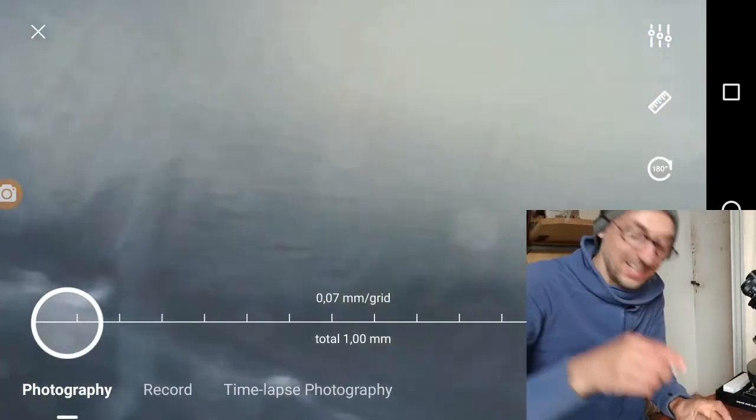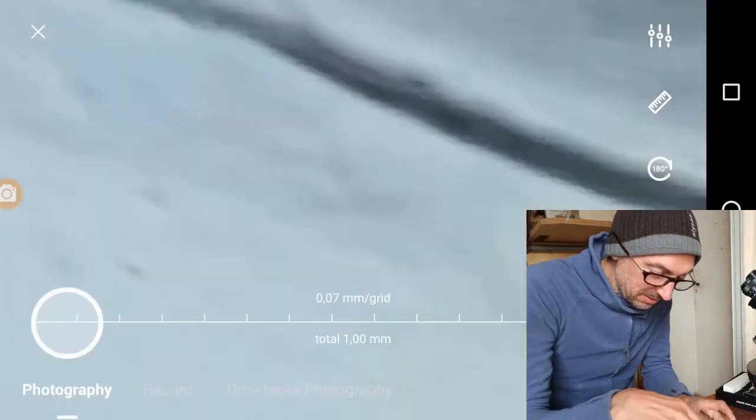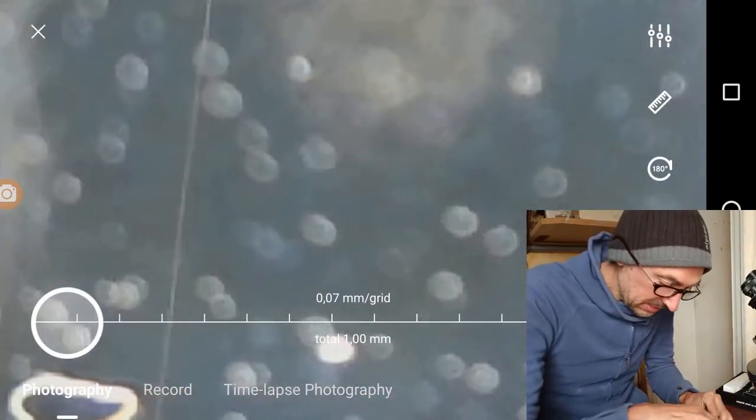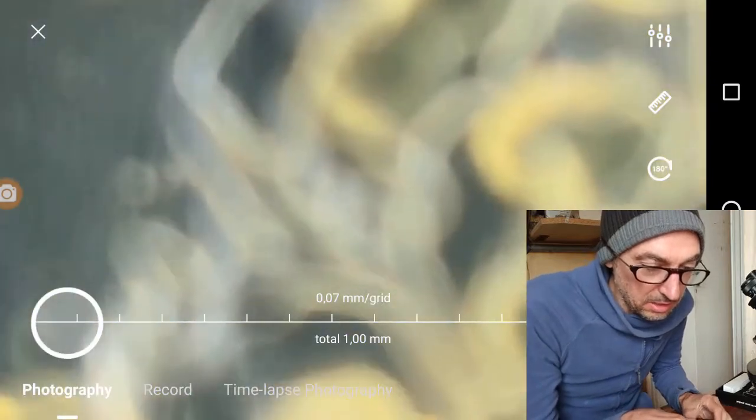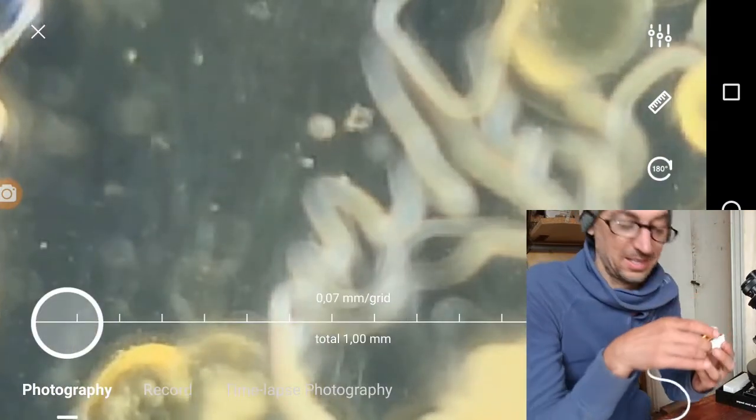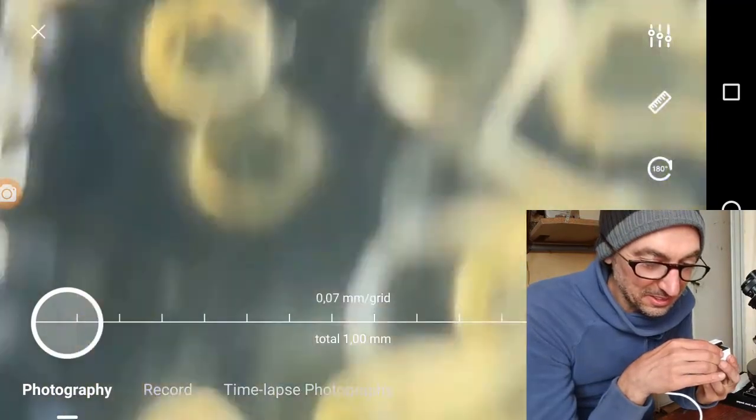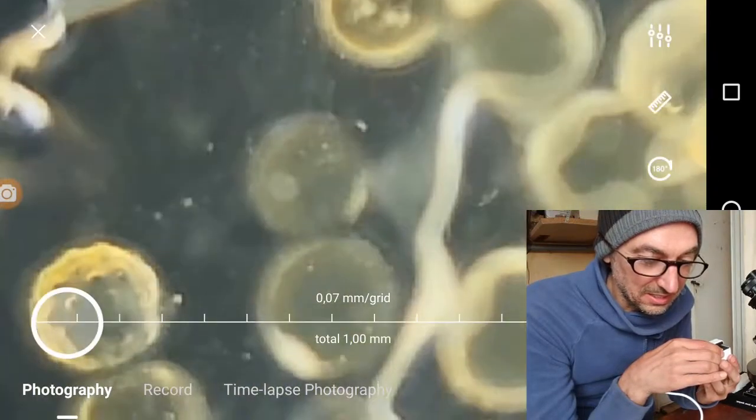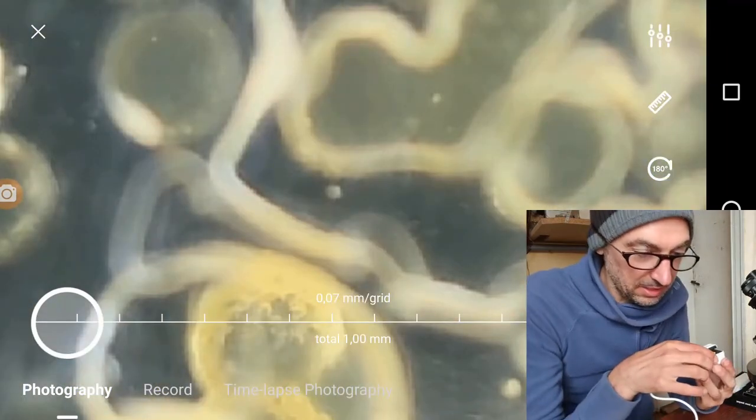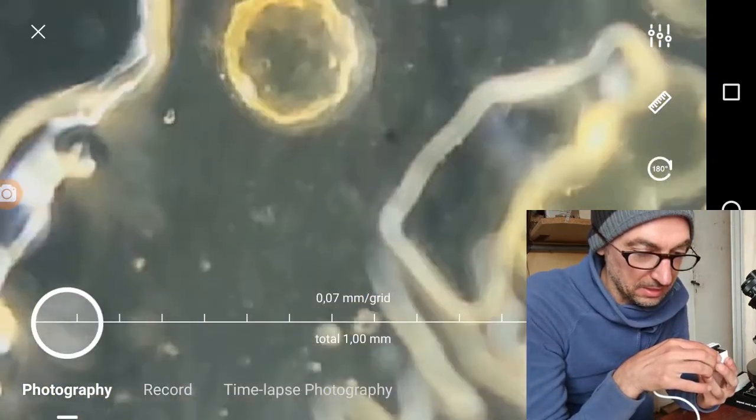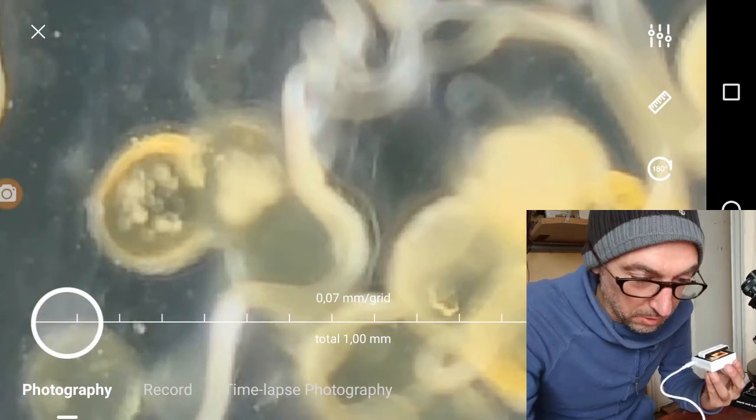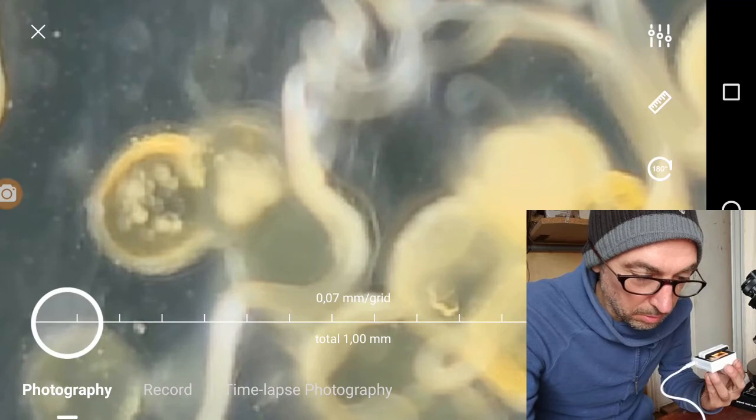Now we have to remove this slide - it only goes back in one way. It's very easy and quick. You can move it around - you have to be careful. There we are. Let's try the manual focus here.